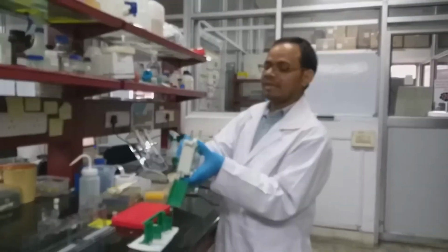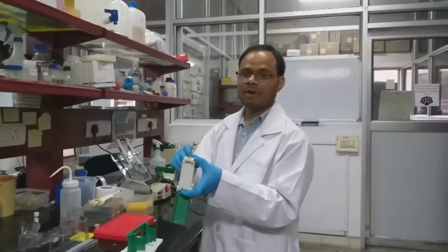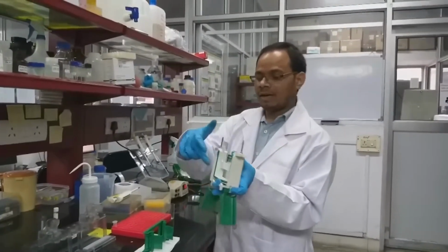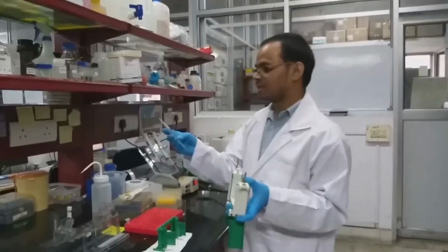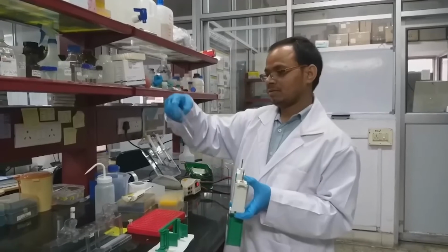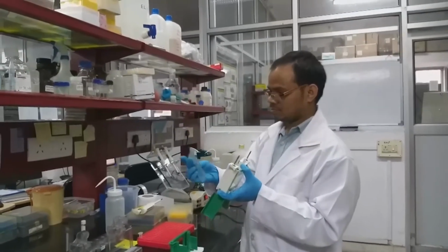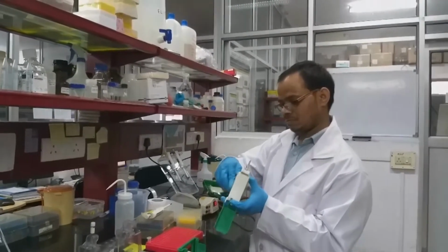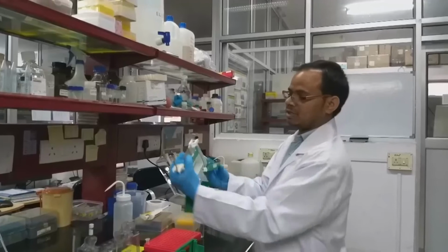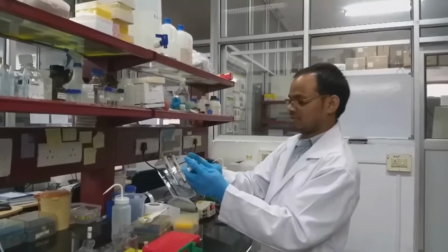So inside this tank, we only have this side one. You have to cover the other side also. So for that we use a dummy plate. You just hold it tight and close this thing.